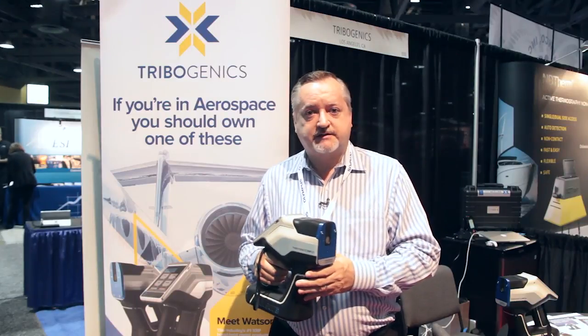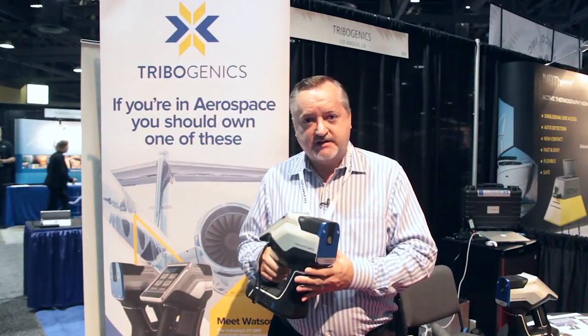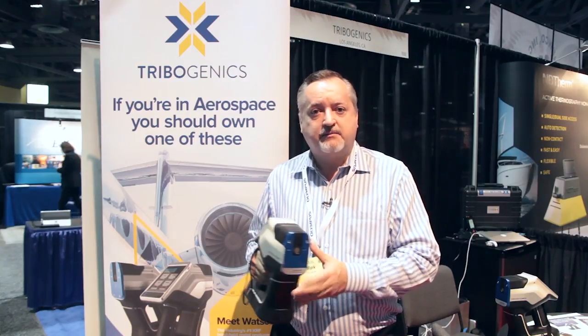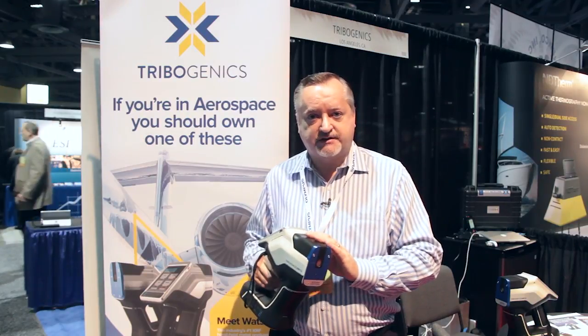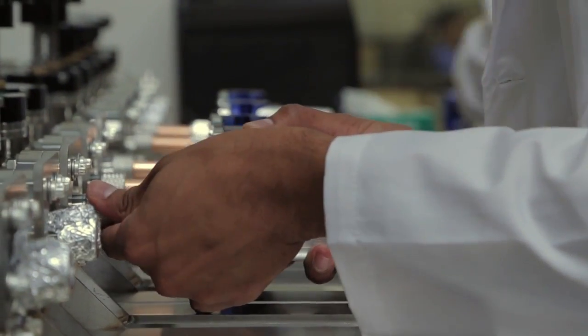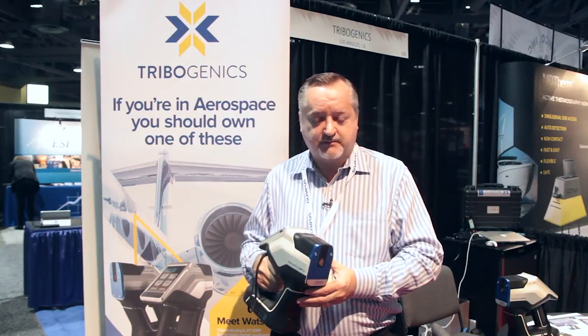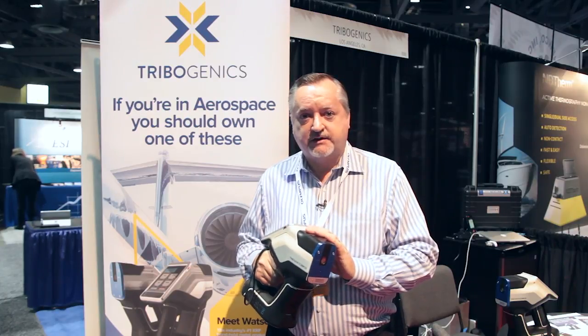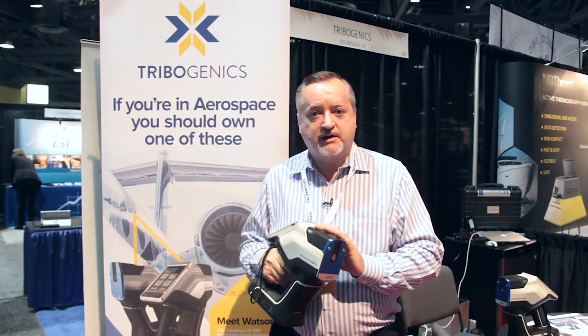There are a number of other points where Watson scores. One: guaranteed uptime. You never have to worry about sending the unit in for service and waiting weeks for it to come back because your X-ray source died. The Tribogenics M1 cartridge fits in in two minutes and allows you to be operational in no time. Second, Watson has onboard calibration, so we can do calibration whenever the Watson changes environment, changes altitude, or whenever you start the work day.